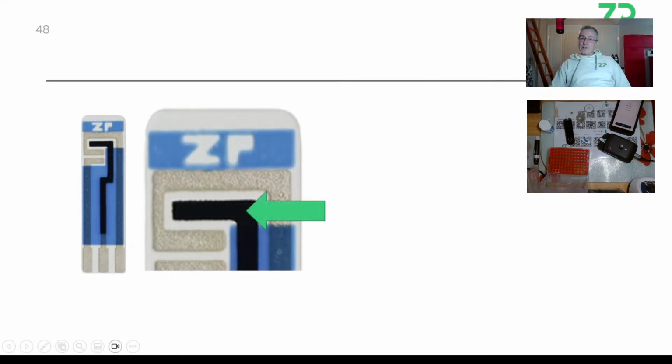Now, what I would say as well is that you're using our carbon electrode. You've given us nothing specific to do. So what I mean by that is, when you turn this carbon electrode into a biosensor, then monitor whether your now made sensor is actually stable or not. But carbon, it's almost like it's very undefined what it's actually doing in this situation. It's just sitting in a solution, and it's reacting to whatever the solution's up to. So it's not necessarily the carbon that's changing. It's actually just reacting to the solution that genuinely is stable.